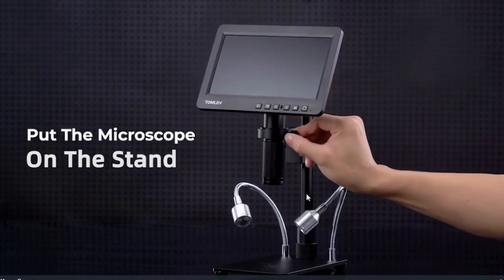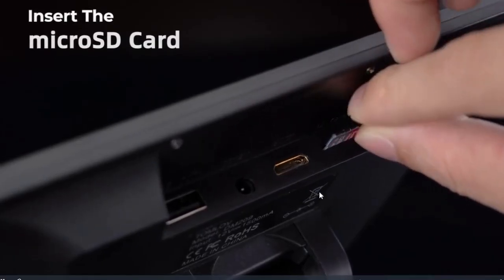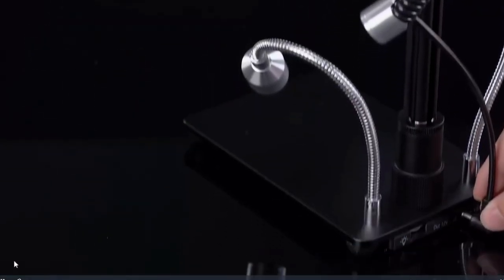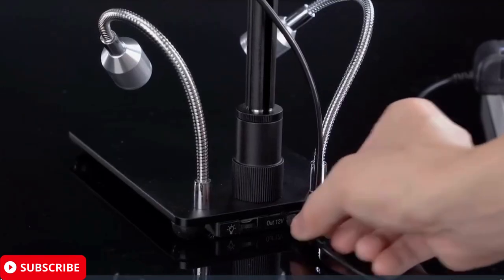If you're someone who's passionate about exploring the intricacies of nature and science, but traditional microscopes just haven't been cutting it, then stick around because this one might be exactly what you've been searching for.